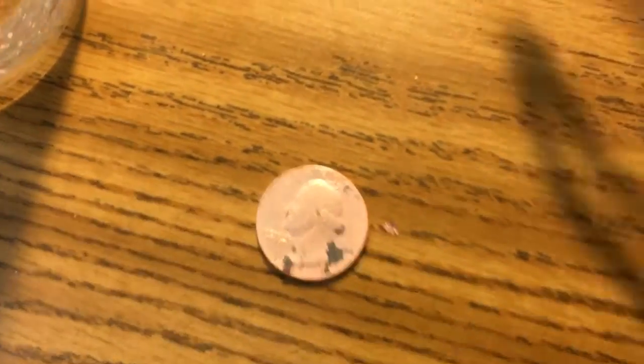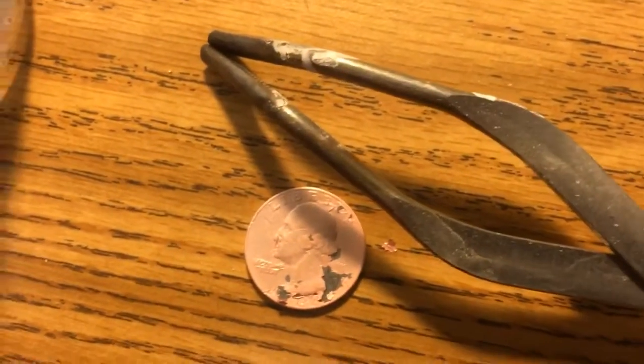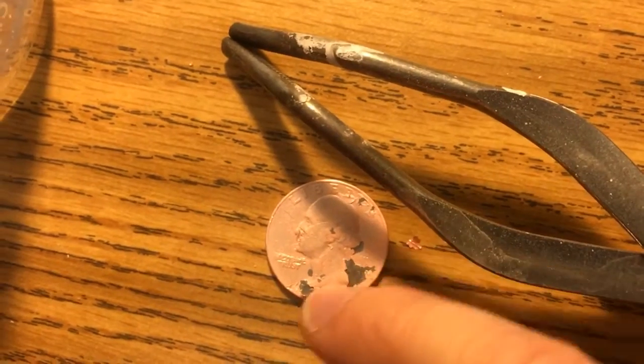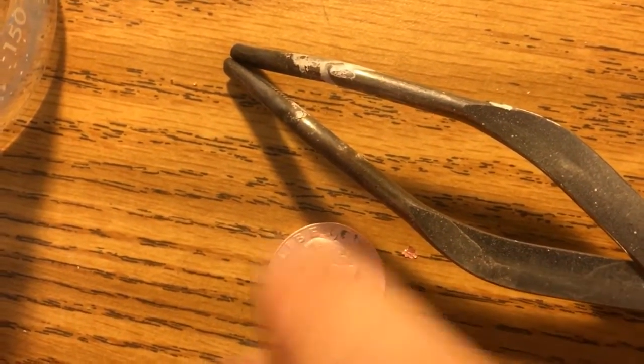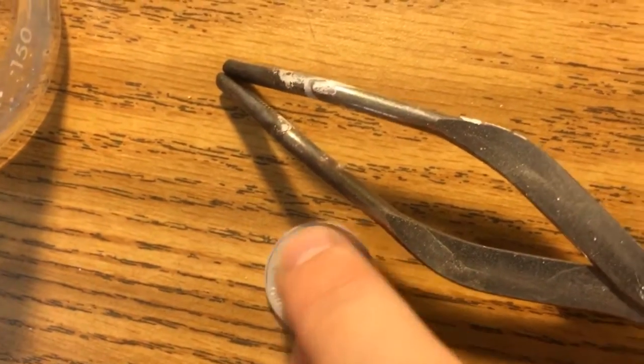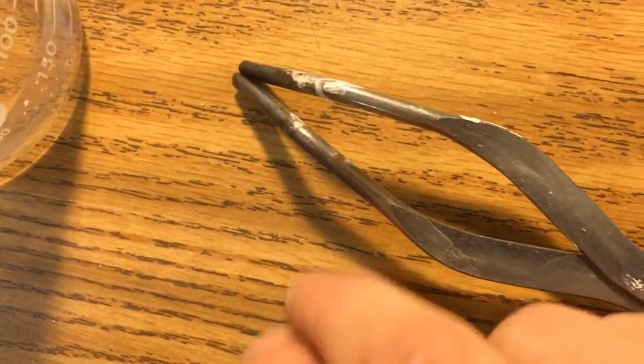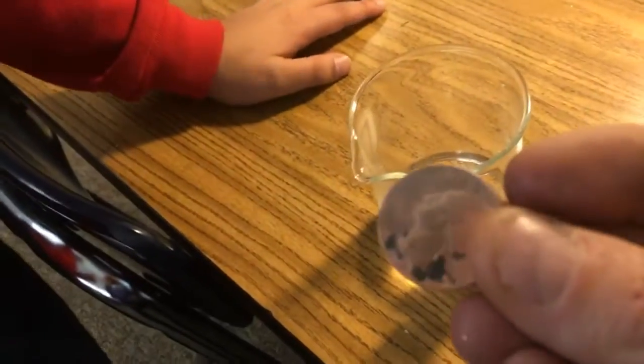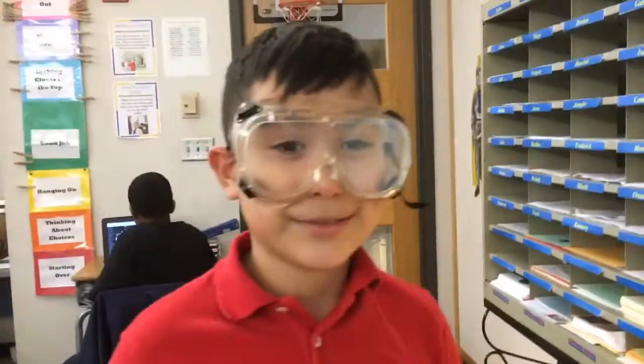Alright, here it comes — we're going to dry it off over here. If you look at it next to the silver tongs you can see that color change. You can actually see little flecks of silver still electroplated to the quarter, but most of it is decomposed and has come right off. Here's the other side — very different. So Diego, you have an interesting souvenir from today — decomposition of silver right off of a quarter. Way to go Diego.